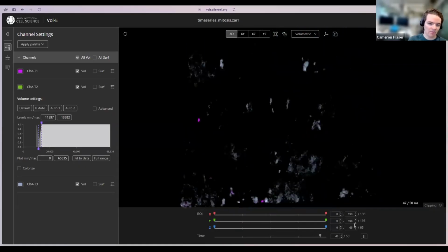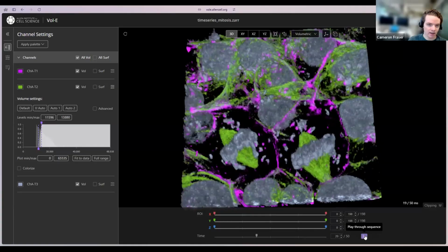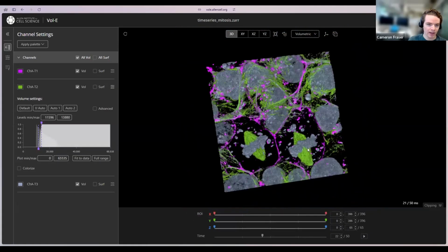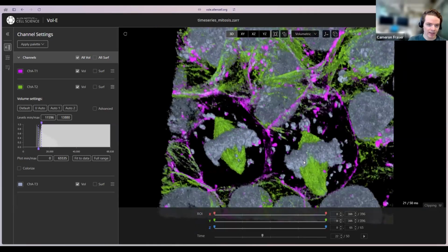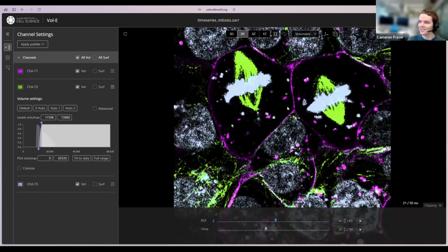And then if I let this settle down on a time step, let's say right before both of those cells are about to split, I get my higher resolution level back. More rendering settings up here. I can pop into 2D mode. Continuing on the theme of adaptive resolution, I've now just gotten a higher resolution image because, again, this is chunked.